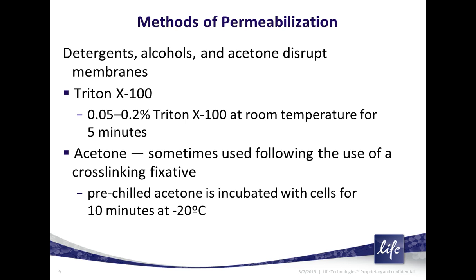Some people will use a 50-50 methanol acetone for fixation and sometimes for permeabilization. If you fixed your cells using a solvent, like methanol or acetone, you usually don't need to follow up with the permeabilization since it's already delipidized and now large molecules can enter into the cells.